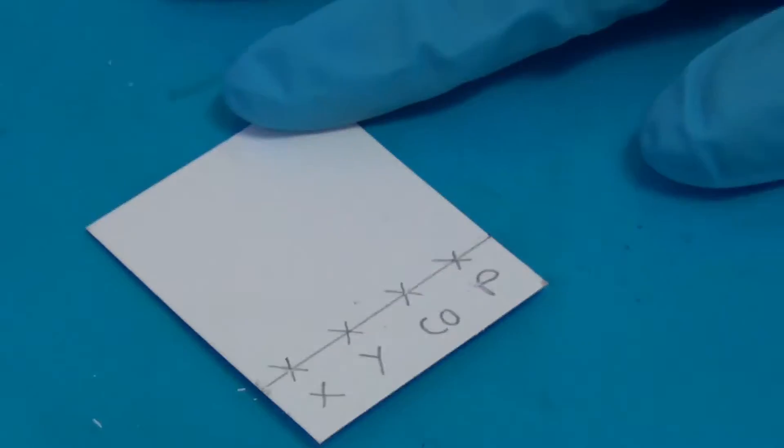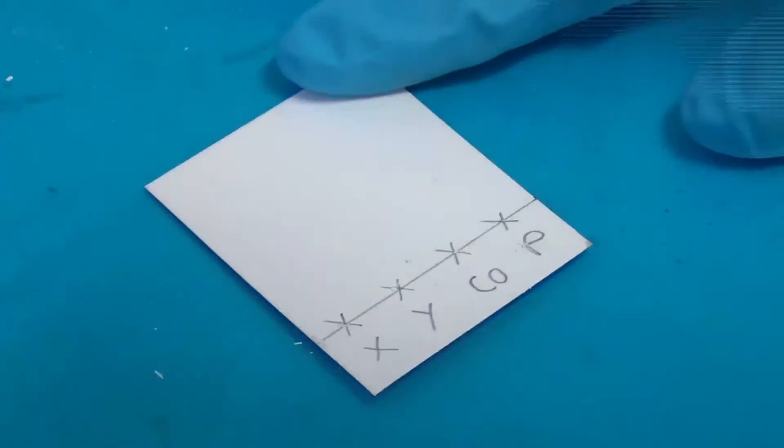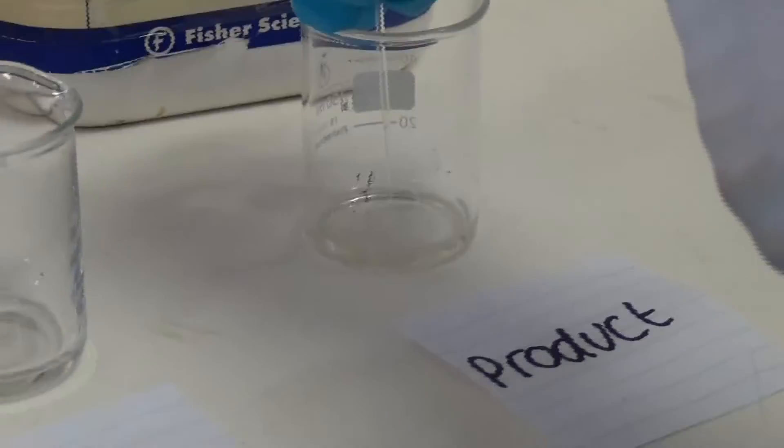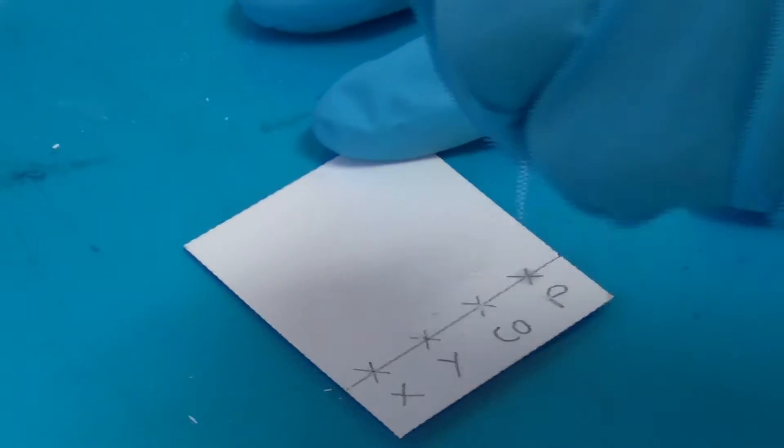Then repeat the spotting process using a clean capillary tube for the other solutions on the appropriately labelled mark on the TLC plate, and make sure to also spot each solution on the co-spot.